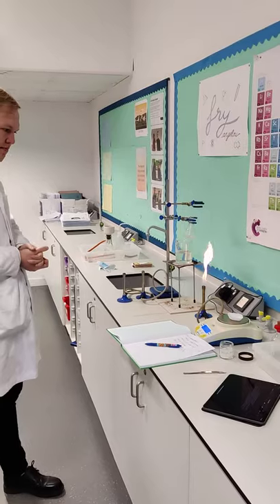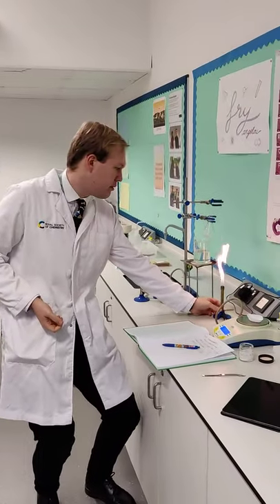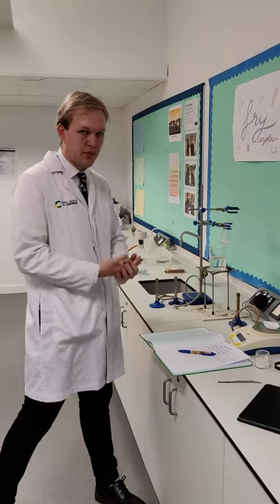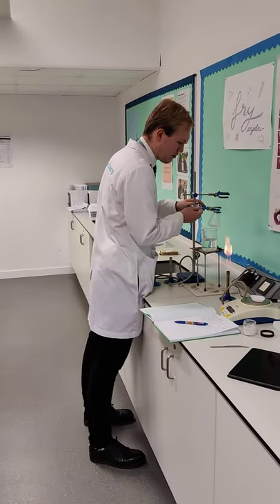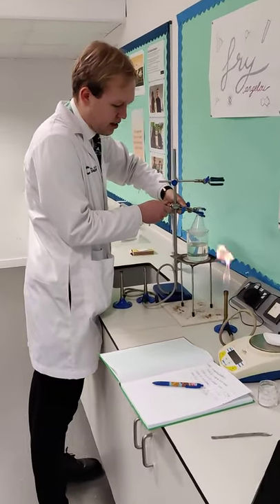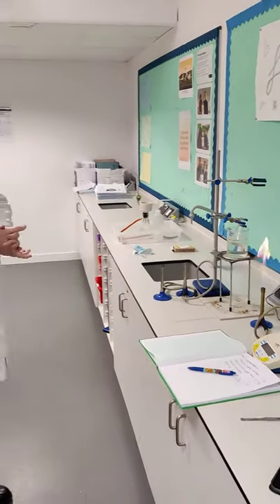Why have you got the Bunsen burner on a bright yellow flame? The purpose of this is that it's a safety flame. If you turned it to the hot blue flame, it's a lot harder to see, and also it's more dangerous because if you accidentally waft your hand or a bit of paper near it, it's more easily going to catch fire. So I'm turning it to this so I can see it and it's a more controlled flame. Now hopefully this should be ready to put in — gently placing it into the water. Don't leave it for 20 minutes without making sure the temperature doesn't exceed 65 degrees Celsius — use a thermometer.